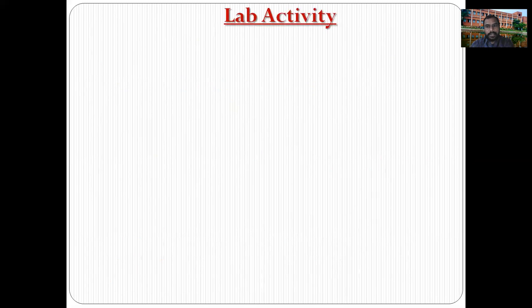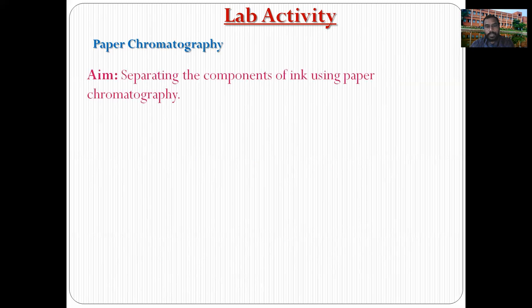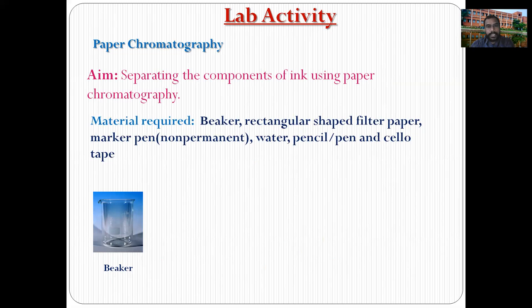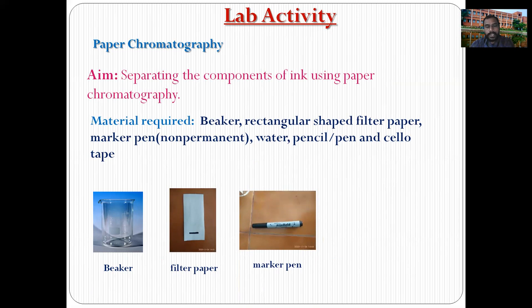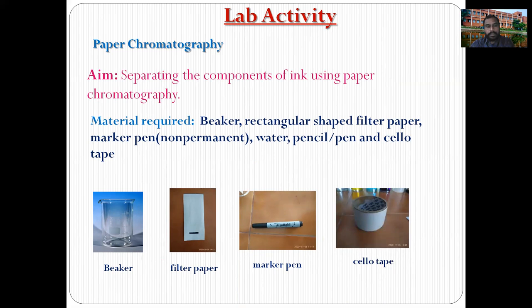Lab activity of paper chromatography. Aim: separating the components of ink using paper chromatography. Materials required: beaker, rectangular shaped filter paper, marker pen, water, pencil or pen, and cello tape. These are very simple materials, and using them we are able to do the paper chromatography lab activity.